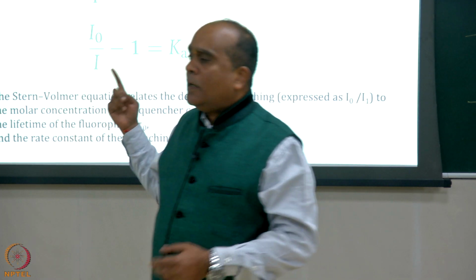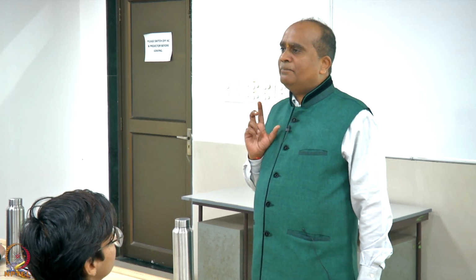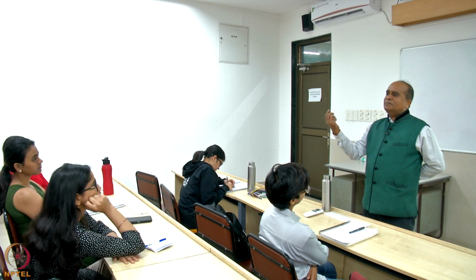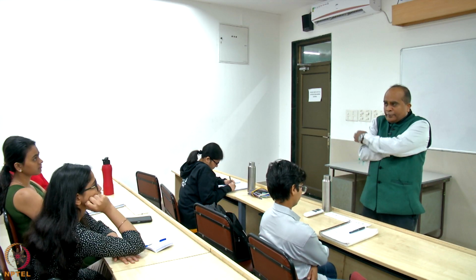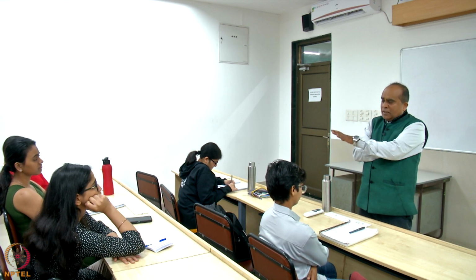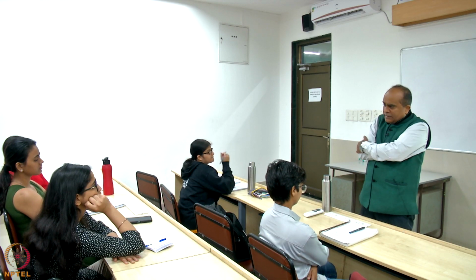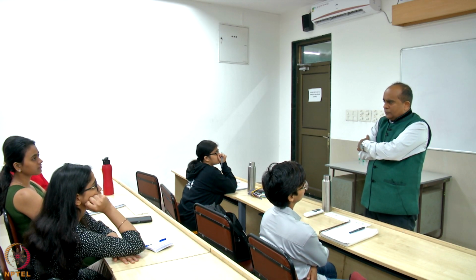In dynamic quenching, the quencher is interacting with the fluorophore's excited state and taking out the energy. Now, remember the quencher has to interact with the fluorophore, right. अब किस fluorophore से quencher interact करेगा, जो fluorophore जिसका environment free होगा interact करने के लिए, जो fluorophore buried होगा, quencher cannot penetrate to that. The quencher cannot reach the fluorophore which is buried inside, because the quencher is a molecule.